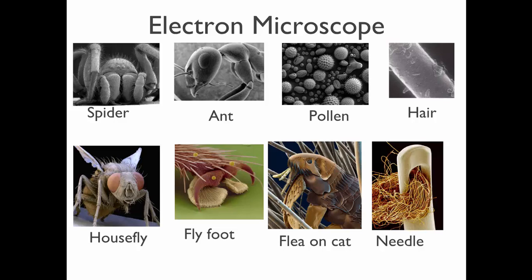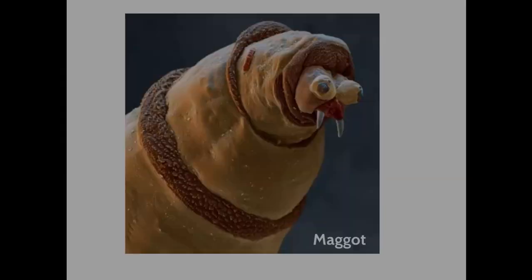An electron microscope doesn't use light to create the image. It uses electrons. It sends a beam of electrons at the object. They reflect from the metal and are picked up by a sensor. Because electrons are very, very tiny, as we learned, they give a very great deal of magnification and resolution. So when you see these color images, they've been artificially colored. They've made the background green and the other parts red, just to allow you to have an easier time seeing them.